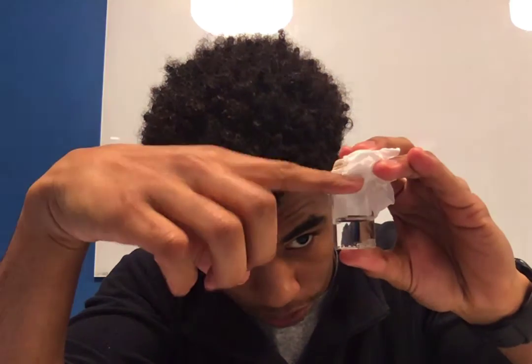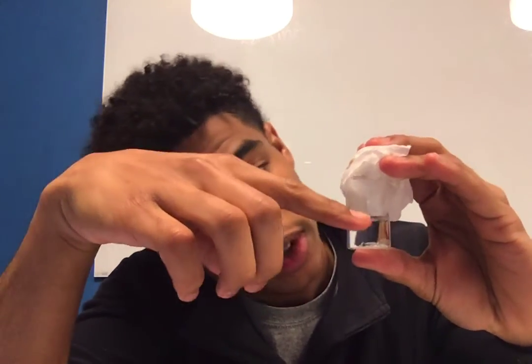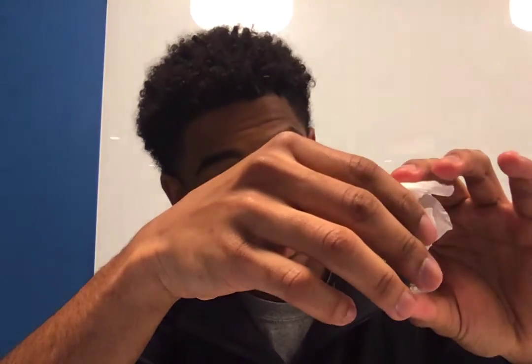One thing that I would like to note is how much of the solution has actually evaporated. When we first began, we had basically a full vial of solution, but now we're about halfway. So obviously, there's been a decent amount of evaporation occurring.